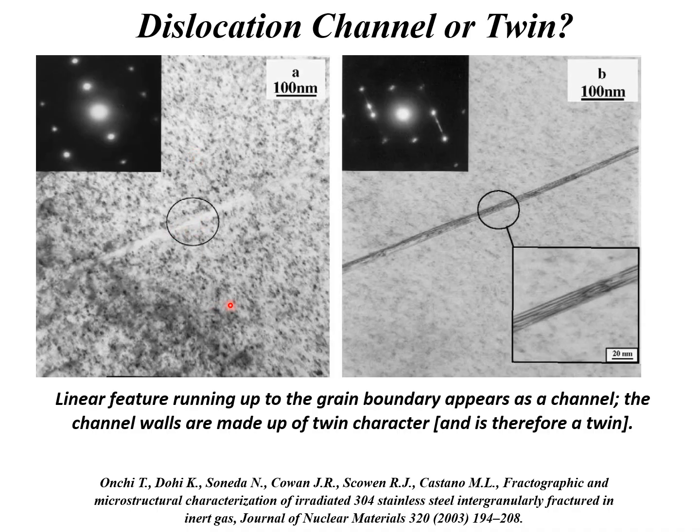I realize I need the pointer, not my mouse, to show up. The difference between these regions is not because there are no defects in this region, in this channel. It's because the crystal in this channel is tilted to a different orientation, and this is shown here where Onishi tilted it and shows up the contrast because it's a twin.